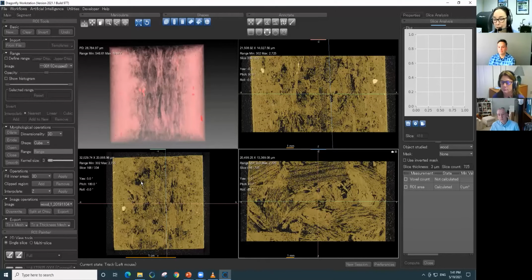What do you think, Mike? No, I agree mostly with that. There are cases where, for material scientists, you're often looking at very demanding samples that have subtle texture differences, where you strongly benefit from machine learning techniques such as the one we see here, or deep learning techniques.